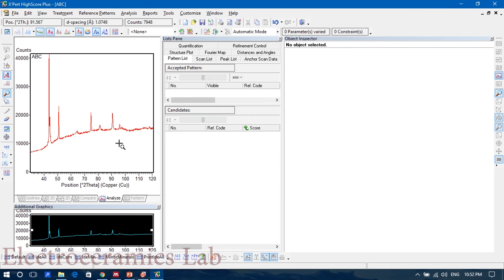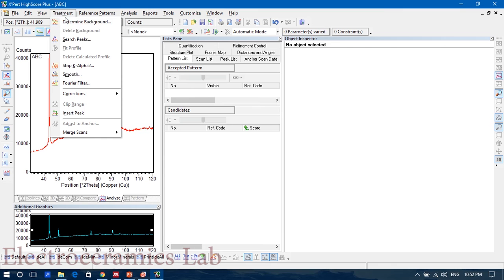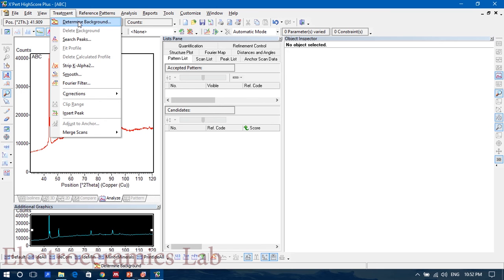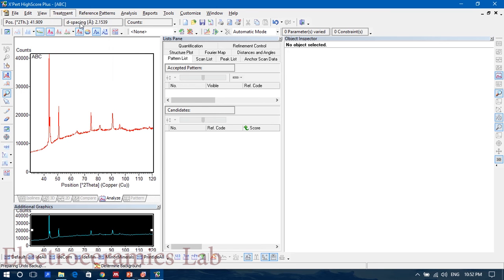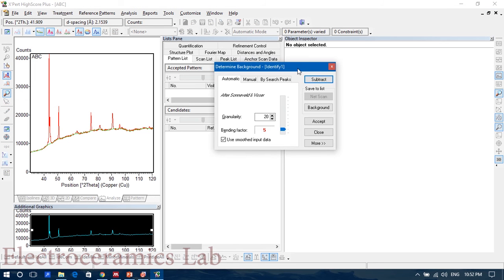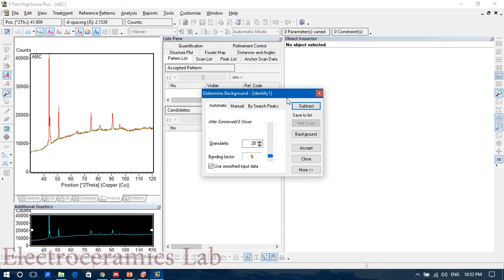So this is the data. Go to Treatment, go for Corrections, no, directly go to Determine Background. A window will appear, then click Subtract.